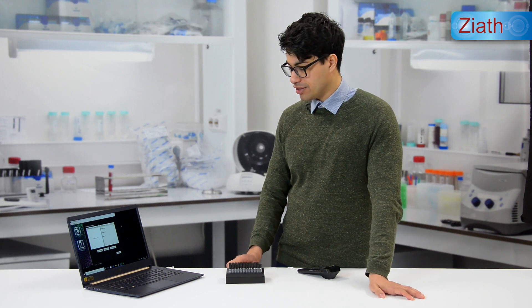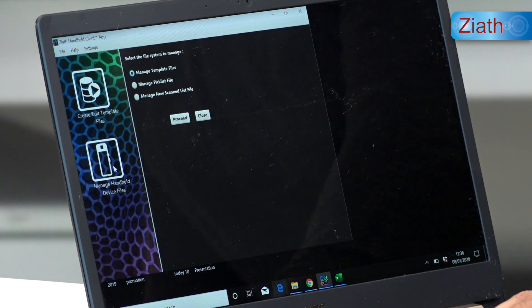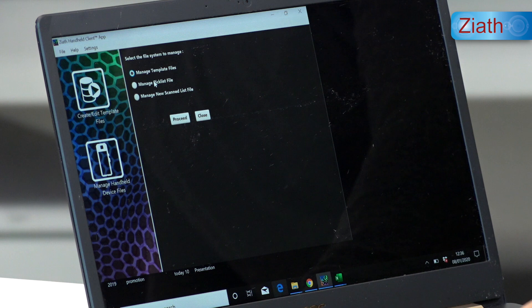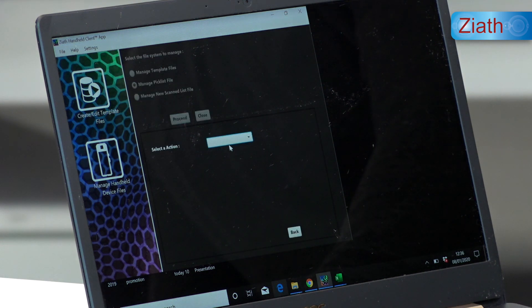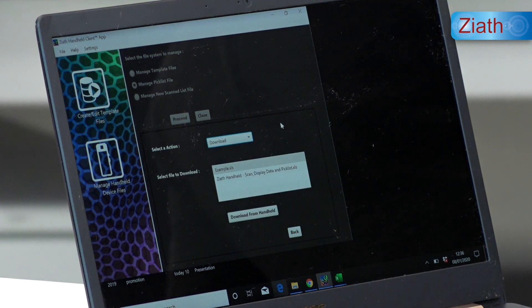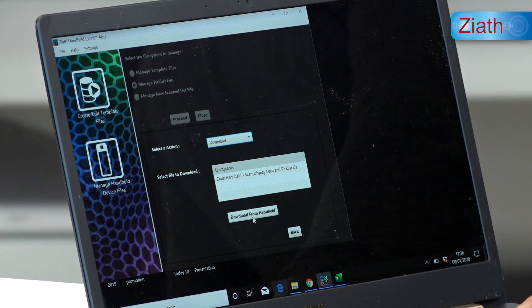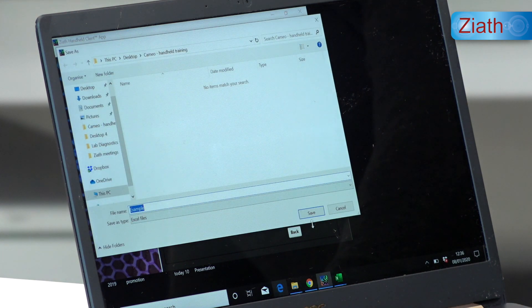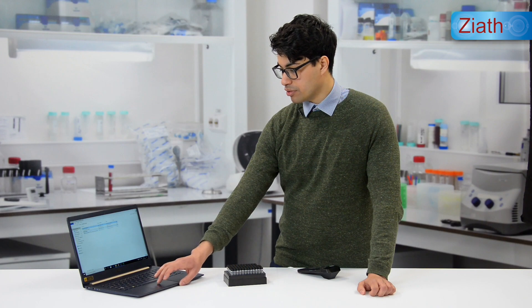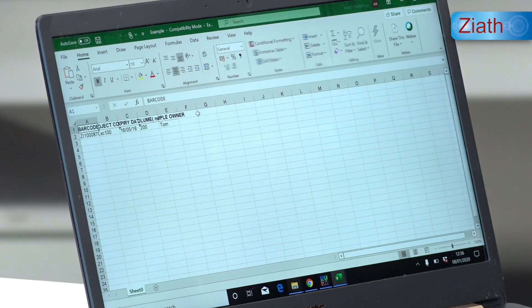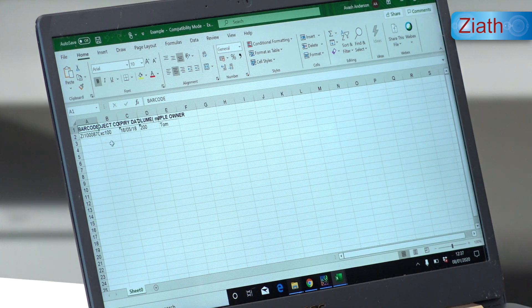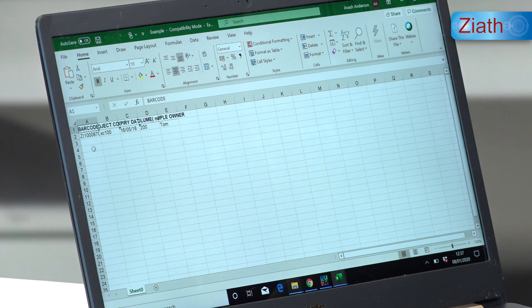To locate the Excel file created on the handheld with the new sample information, we go to manage handheld device files, manage pick list files, and select download from the handheld. You can see an Excel file has been created with the same file name as the template we created. If we download this file, click save, and open the file named 'example', it should show one tube that we just added with the handheld, and the information inputted via the add and edit sample information is now shown on screen. If multiple tubes were added, they will be shown in a list.